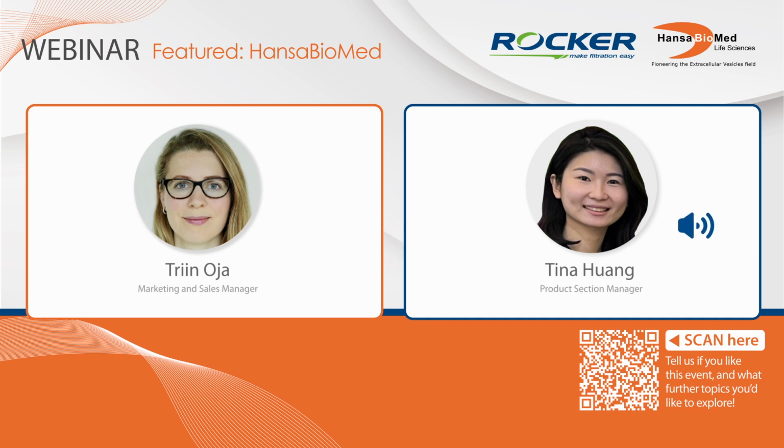Okay. Yes. So in this case, if users want to make sure of the sterility, you would recommend enlarging their samples, like to 5 liters or more, for instance, for one-time use. Yes, for instance, if the aim is to keep the sterility, as I mentioned, it can be used to eliminate exogenous vesicles from fetal bovine serum. You can process, for instance, 1 liter or more in one go, then aliquot the sample and put it in the freezer. In that way, you have used the maximum of this filter and also kept the sterility. Okay. There is not any other possible way.